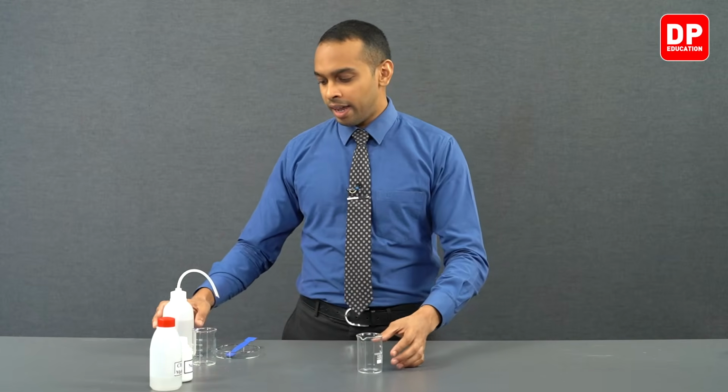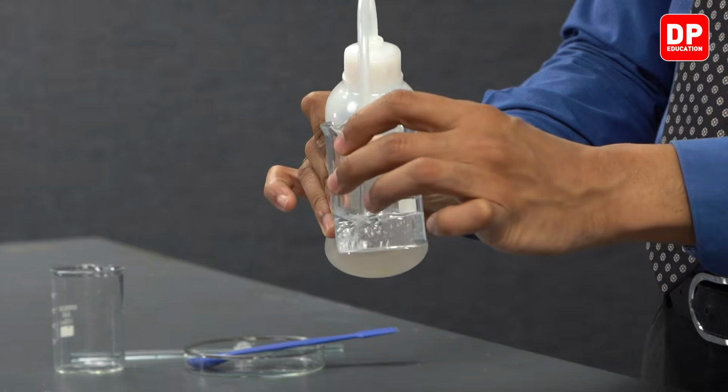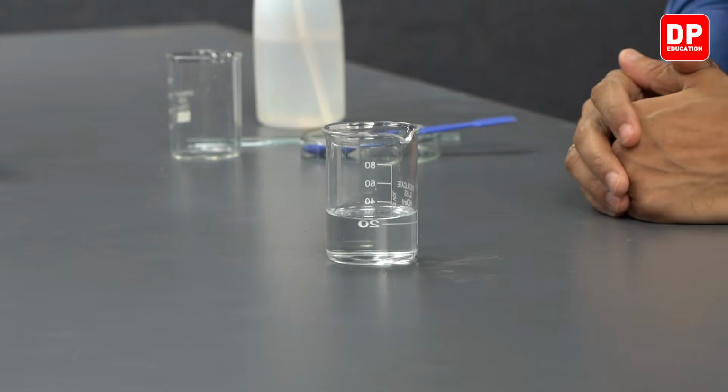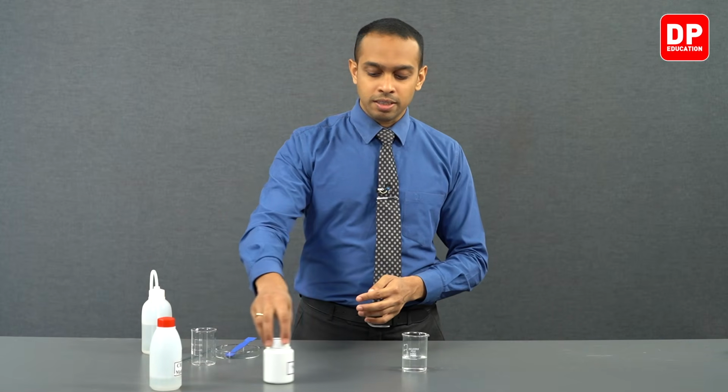So to observe how sodium sulfate absorbs water and clumps together, we can use a beaker and add a small amount of water into this beaker with the use of a wash bottle. And to this beaker, we are going to add a small amount of sodium sulfate.